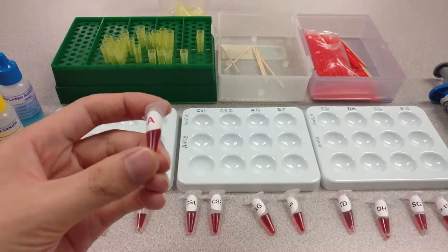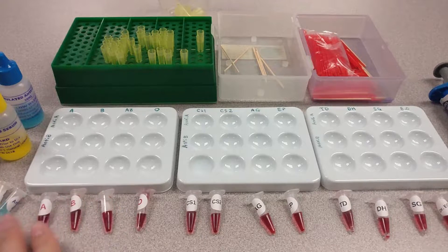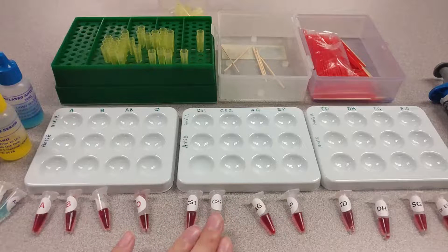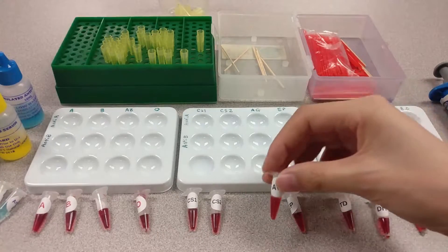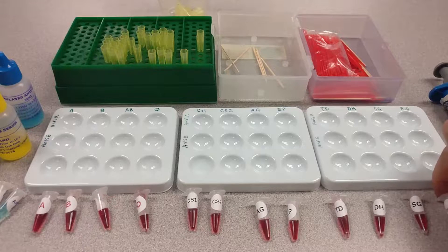I have prepared more than enough for two rounds of micropipetting. Here are the controls: the positive controls for type A, type B, type AB, and type O. These two here are the crime scene samples, which we should have determined from Part 1 of this activity are very likely to be blood. Here is Ana Garcia and Eric Piedmont, Taylor Diaz, Dominique Hall, Sam Green, and Dr. Elsie Opal.